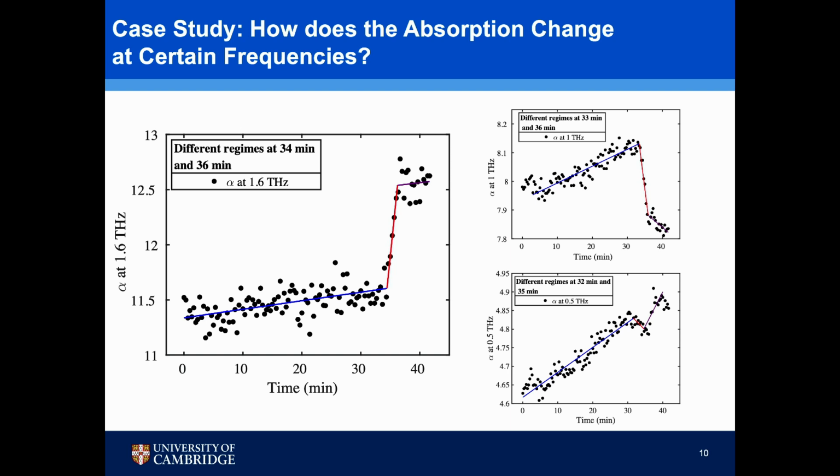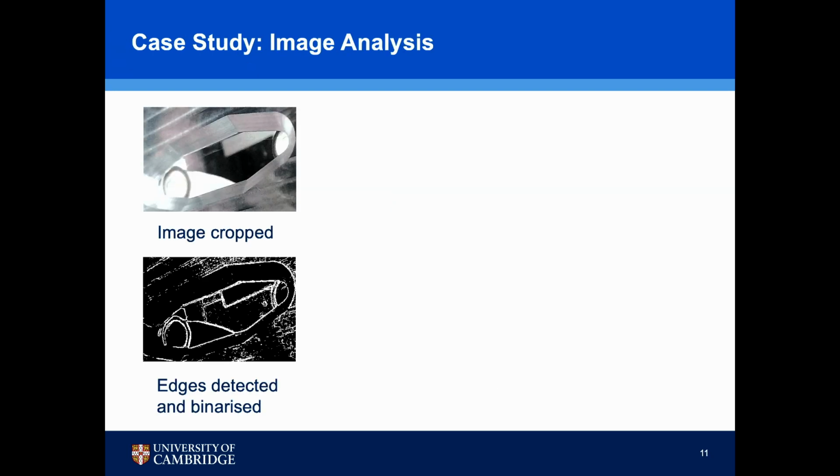But why the absorption after the growth starts to drop a bit at 1 terahertz while increasing a bit at 0.5 terahertz, we don't know yet, and we're looking into that later.